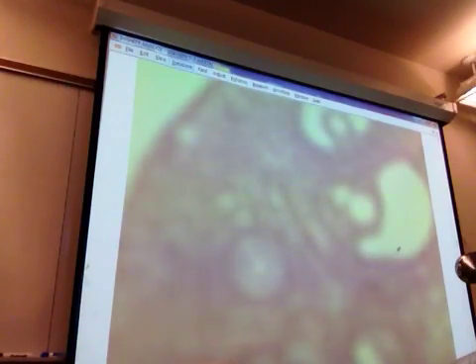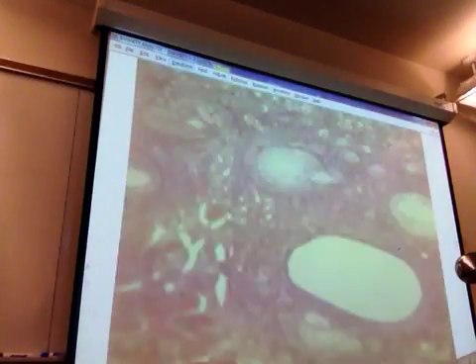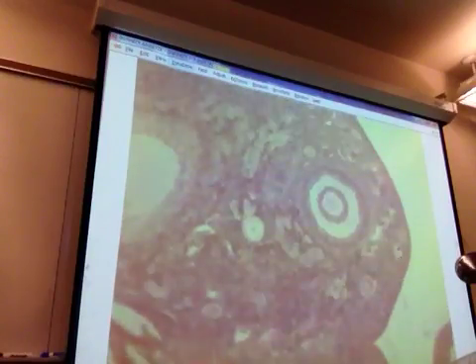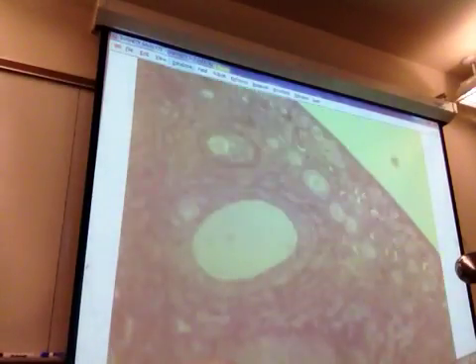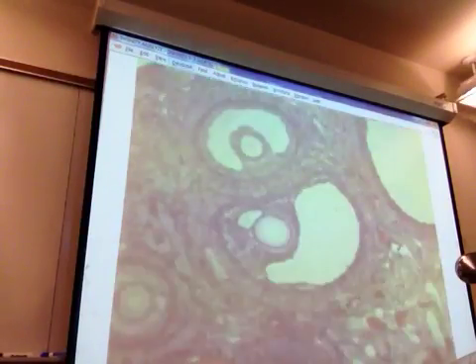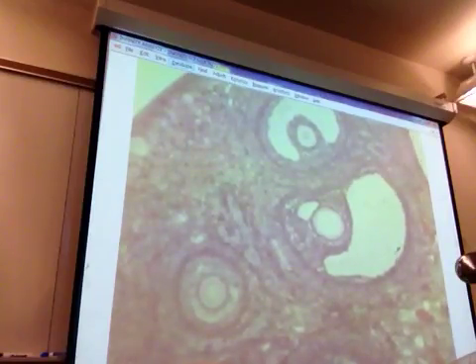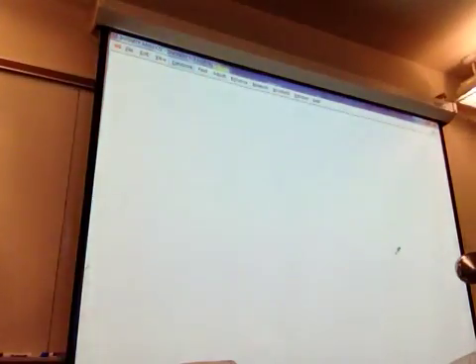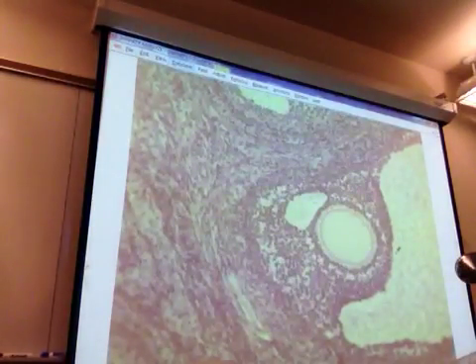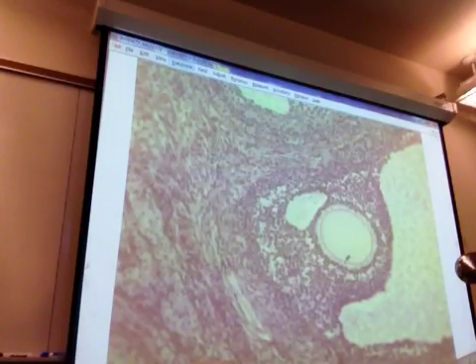So the theca cells are going to be, it's like if you tear a piece of paper, it's not even. Let me see if I can show you guys a primary follicle and you can kind of see it a little bit better. What about on that tertiary one? Can we see on that one? Yeah, you can kind of see them actually on this tertiary one. Let me go up higher. So see these cells that are right up against the oocyte, but you can't see the nucleus because of the cut, right?